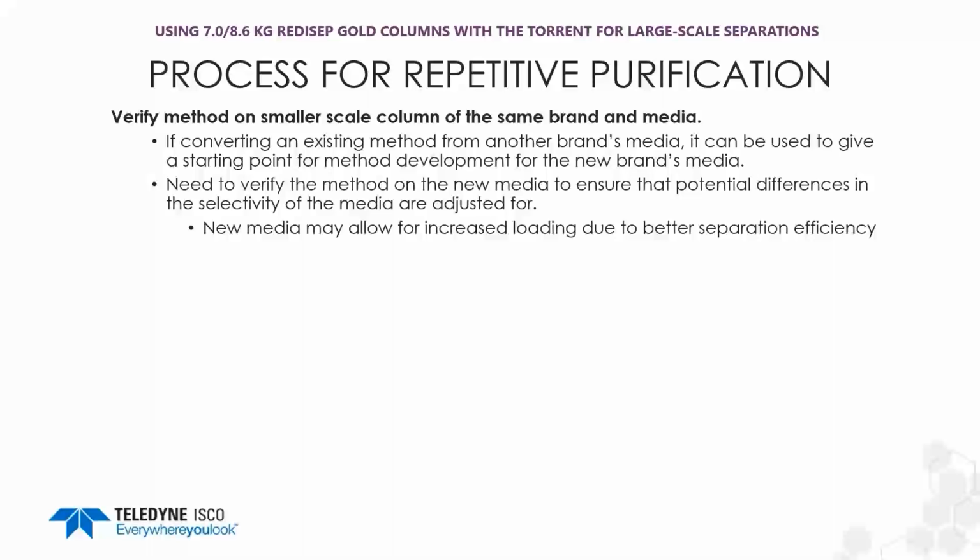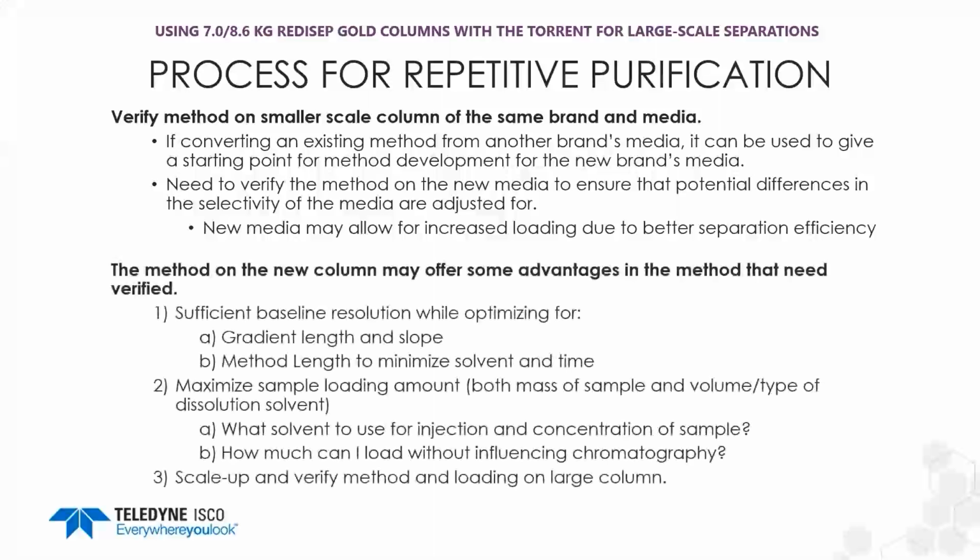And the reason for this is you do want to make sure that any potential differences in the stationary phase, from the pore size, particle size, the carbon content, maybe just a difference in how the functionalized media is bonded to the silica, and then the loading capacity are the same, and you don't see any differences. So we'll do this on the small scale just to verify. And we may be able to take advantage of increased loading of our sample on the new media.